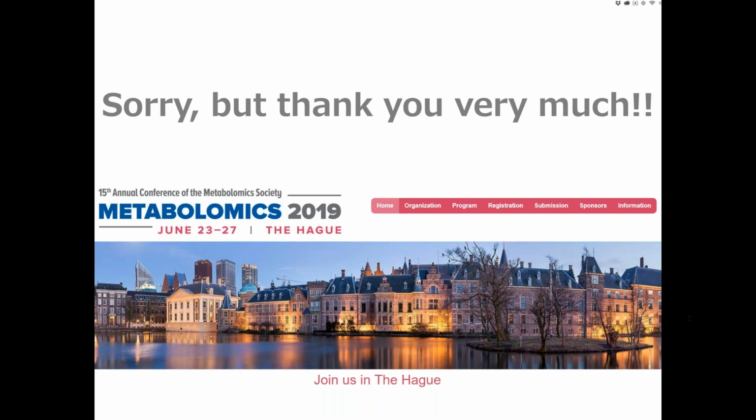There is actually a tutorial on the website, and all of my programs are available as standalone software. But I just want to say there is also linkage among the software that I've developed. And MS-FINDER can definitely import only the MS1 spectrum for molecular formula prediction.